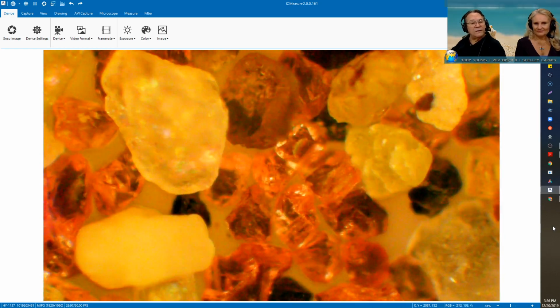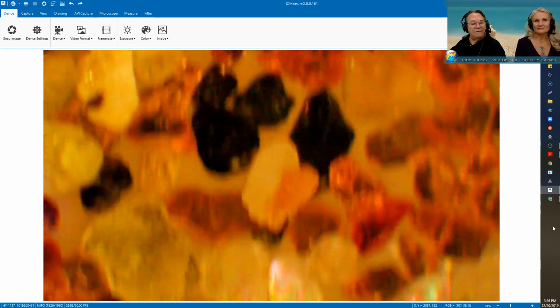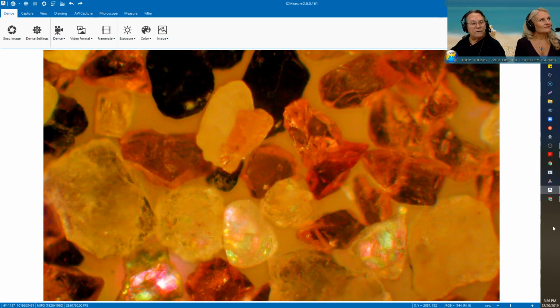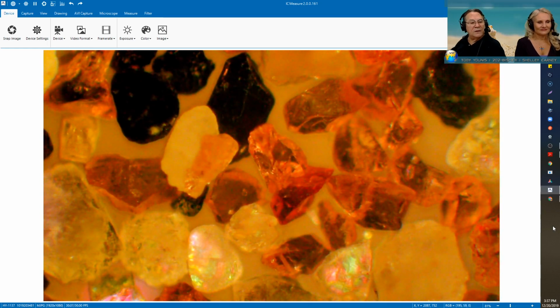The other thing that I noticed about this sample compared to the one that we did from the John Day River the other day was that it didn't have any microgems in it. It didn't have the same sort of construct, like it was an igneous rock, and then when you crack the igneous rock, you'd see some of those microgems inside the crevice that you made. So this, in that sense, was very different from that. It has the sand grains, but it doesn't look like it has the microgems.